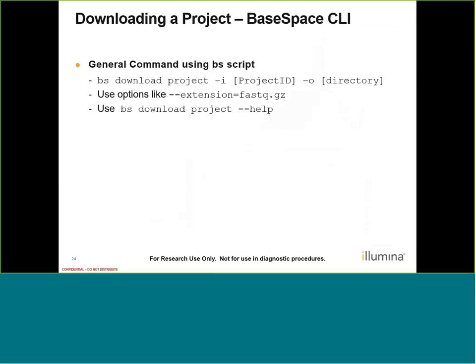Now let's talk about downloading a project using CLI. The general command uses the BS script: BS download project -I and the project ID, then -O for the destination directory. With this command, we can use options like --extension and designate the extension of file types we wish to grab — for example, fastq.gz. You could also specify VCF, genome VCF, BAM, or any other file type you'd like. And of course you can also use BS download project --help to see exactly what options are available.